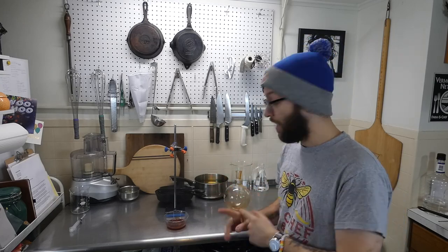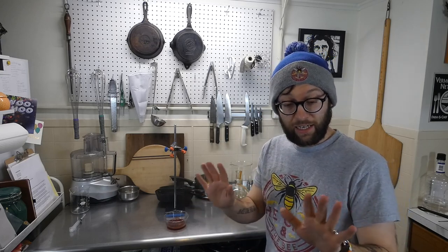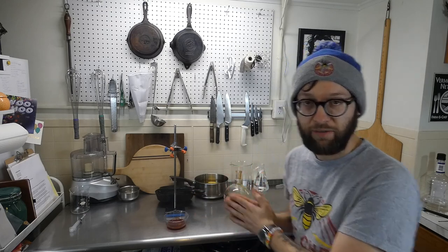I'm going to put gloves on now to finish this. I didn't get any on my hands, so that's a positive. It just hit me as I was pouring it. So make sure you wear gloves if you do this.